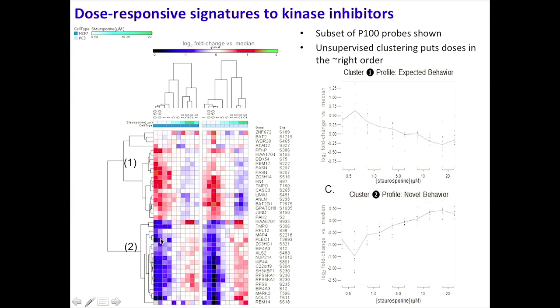And so this was a good early test for us that we didn't pick sites for the phosphoassay panel that just all did the same thing and all read out the same kind of biology. We're able to get differing responses here, sites that go down, sites that go up, and then there are a whole set of sites I'm showing you here that stay neutral in the presence of staurosporin. And these sites will have very different behavior in response to other different perturbations.